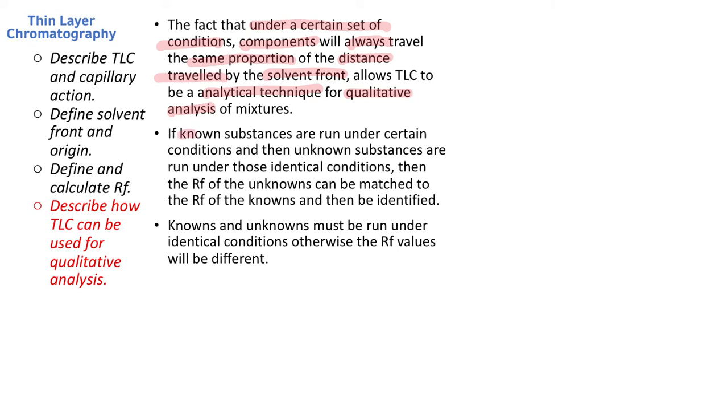So if known substances are run under certain conditions, first you run your knowns, then you run your unknowns under identical conditions, then you work out the Rfs of your unknowns and the Rfs of your knowns, and if they match, then you can identify what that substance is. However, you must have these run under identical conditions, otherwise Rf values will be different.